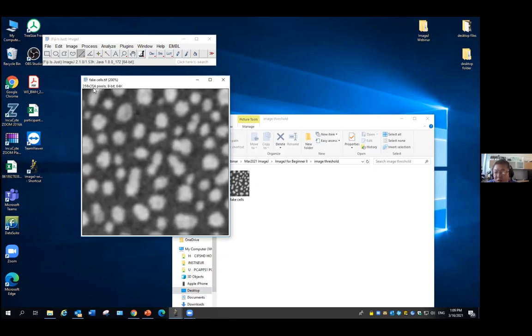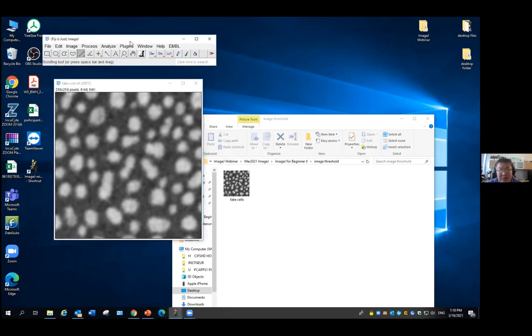If that pixel value is below 100, that pixel belongs to the background, and I don't care. If that pixel intensity is higher or equal to 100, that is part of my cell, and I actually want it. Then I want to check whether this will work.